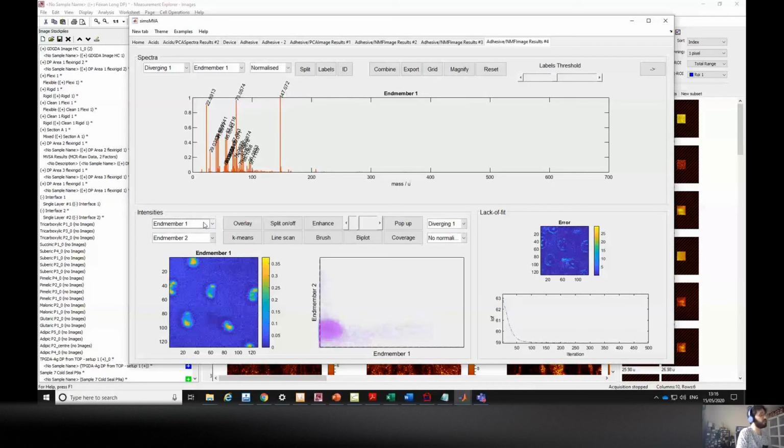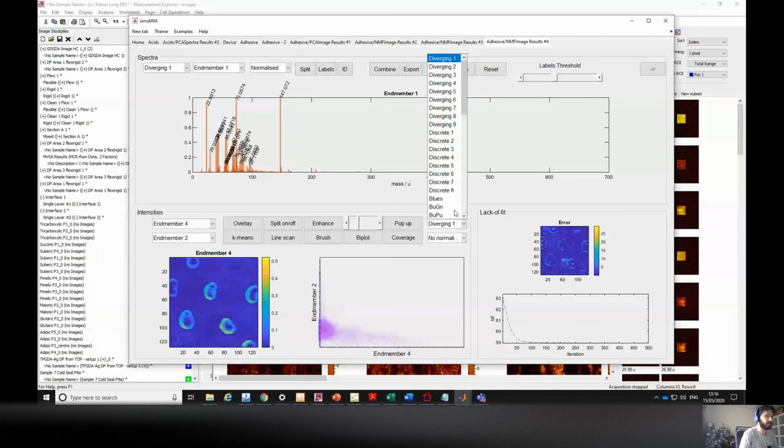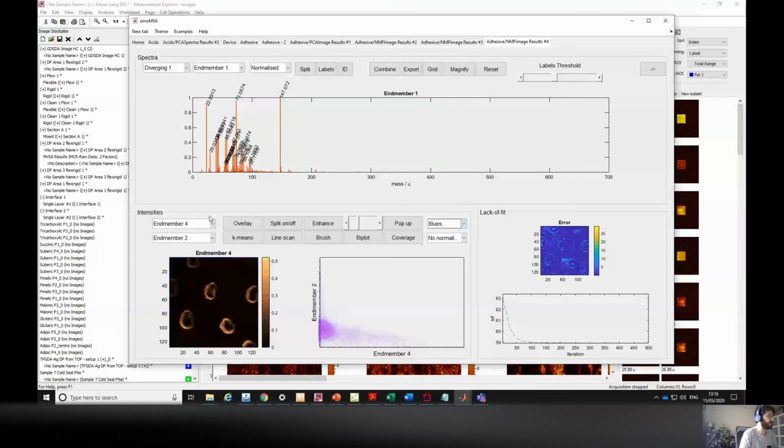And also for each of your samples, it will depend on how much you know about your material to know whether or not this is correct. But okay, so let's explore this one instead.